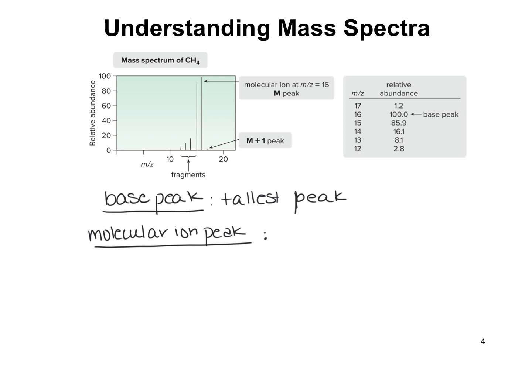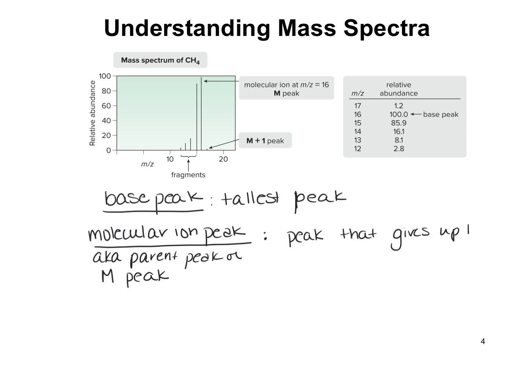Which can also be called the parent peak or the M peak, right? And that is going to be the peak that gives us the molecular weight of the compound.